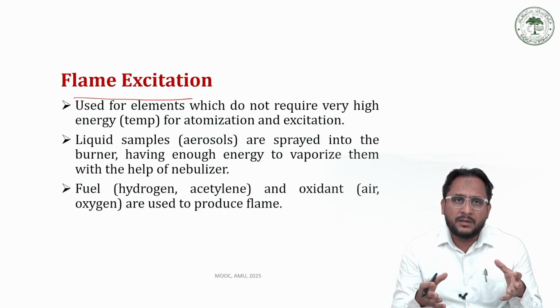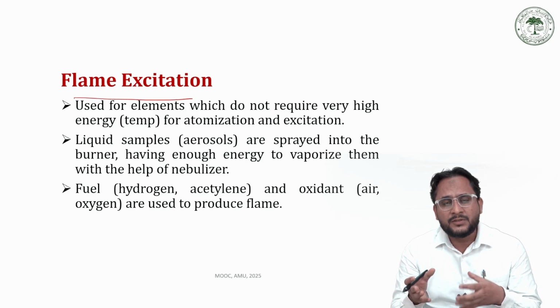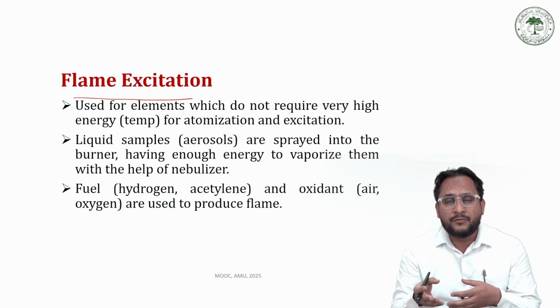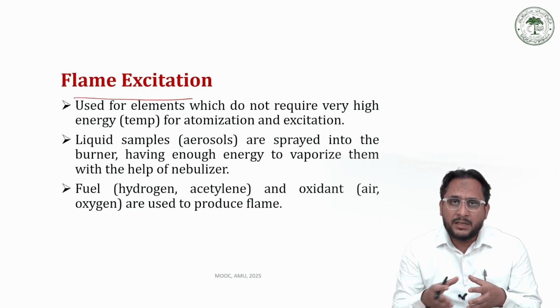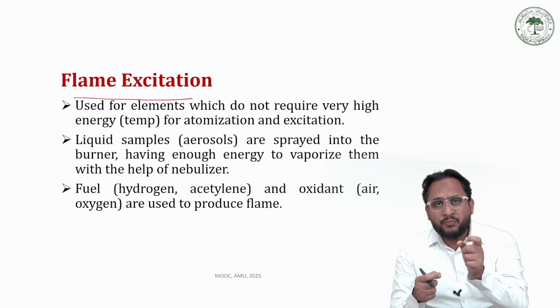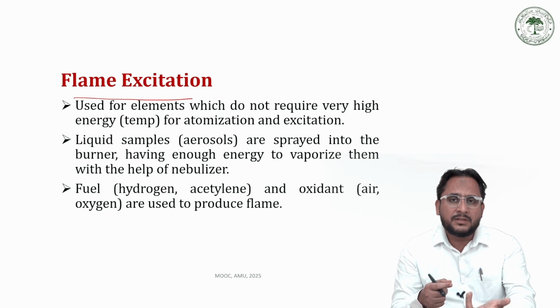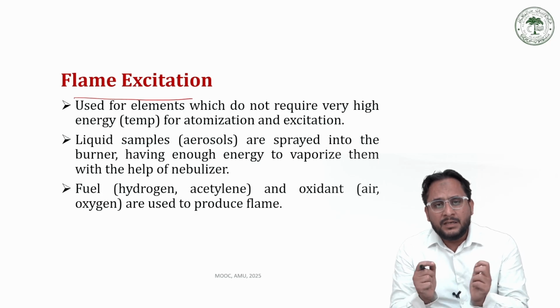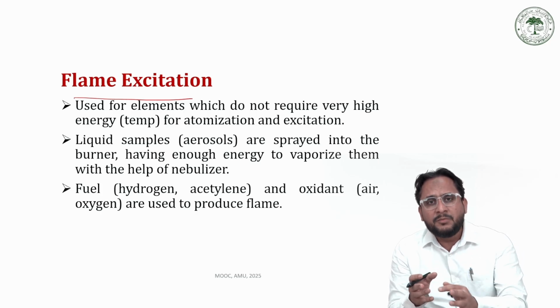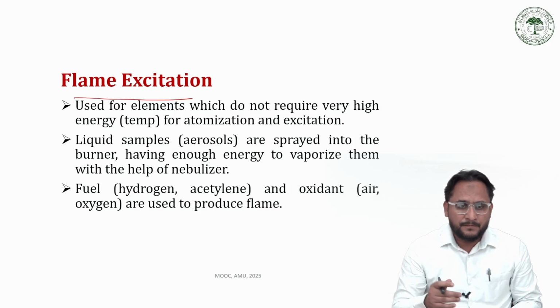So there will always be chances of oxidation, which results in the formation of stable metal oxides that do not dissociate, and ultimately the results obtained are not reliable. So flame excitation is always limited to metals that ionize easily, that vaporize easily, and for which the possibility of oxidation or reaction with oxygen is low.